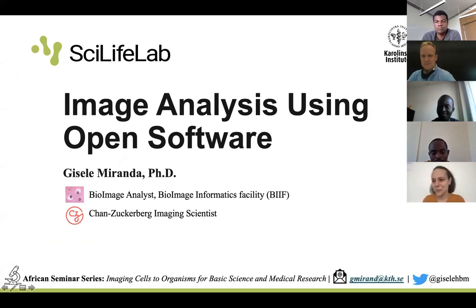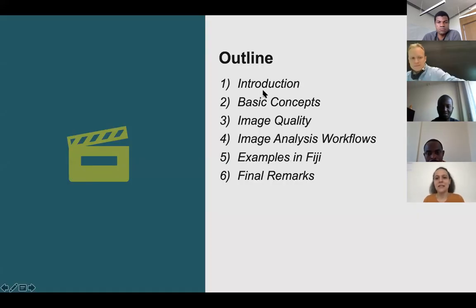It's my pleasure to be here with you today talking about image analysis and software tools for image analysis. So I'm Giselle. I'm a bioimage analyst in the bioimage informatics facility and at the life cell imaging facility at Karolinska. Today I prepared a presentation where I'm going to start by describing a bit what we do at the facility, what our typical projects are.